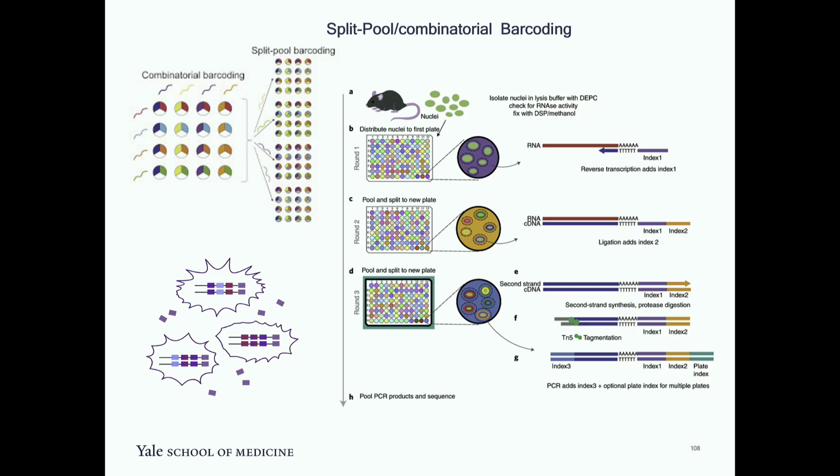Then you don't have to lyse. Lysis happens after all the barcoding steps are done. So cells are initially permeabilized and then the reagents just go inside. Yeah, because you need to maintain the integrity of the cells at that point. So we should know the cell number.